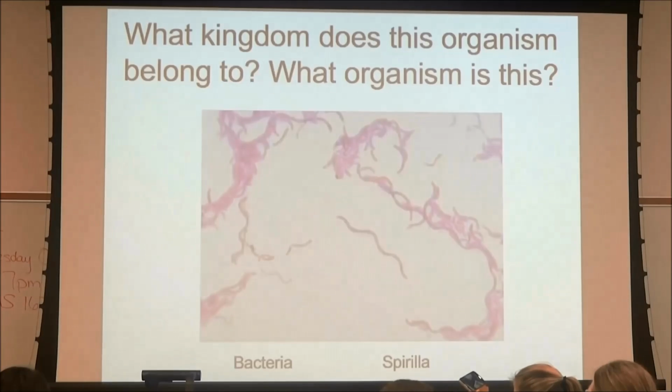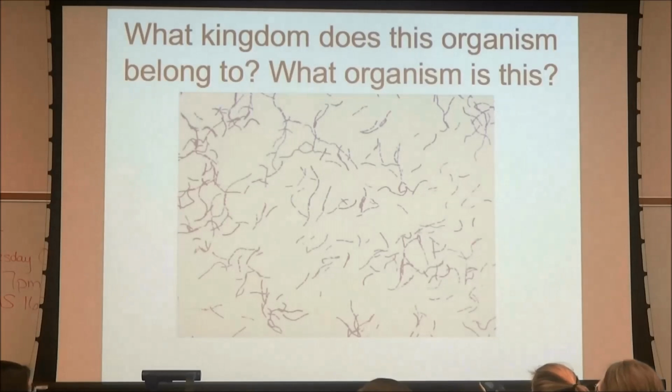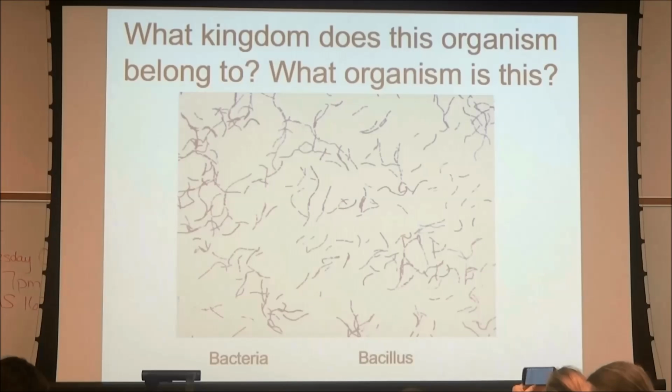You okay if I switch, guys? Okay. What is this? It's a bacteria. Which one? Rod. And what's the technical name? Bacillus. Good, bacillus. Now, how did you know it was bacillus? Right, it's rectangular shape. Good.